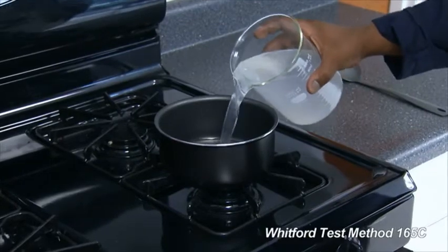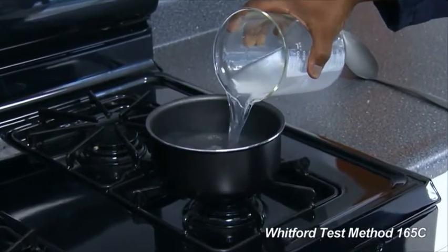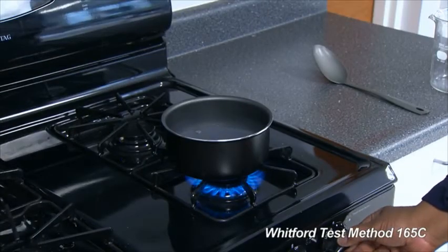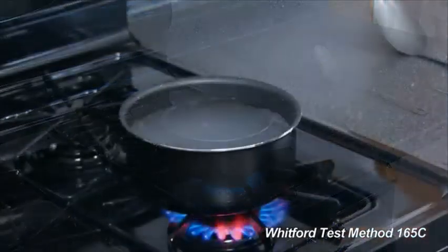Place a pan on a burner and fill it to about 80%. Turn the burner on and bring the water to a boil, covering tightly.